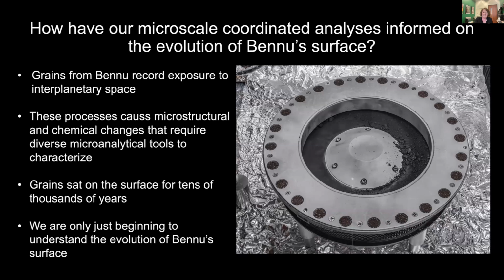And we need a really diverse set of microanalytical tools. We talked about XCT and TEM and SEM, but within those techniques, we've used energy dispersive X-ray spectroscopy, we used electron energy loss spectroscopy, we used backscatter, secondary electron imaging, and all kinds of TEM imaging as well. So we need these diverse tools and techniques to be able to characterize the samples effectively.